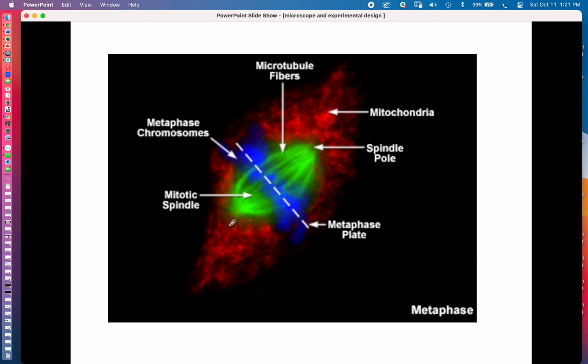And so you can sort of activate the toy by shining light on it and then turn off the light. You see the effect. So fluorescence is different. Fluorescence is a lot like phosphorescence, except the pigments that absorb the light, these fluorochromes, can only hold on to the light for a split second, not long enough for you to turn off the lights and see that glow. But they're glowing like the glow-in-the-dark toy. They just glow really fast.